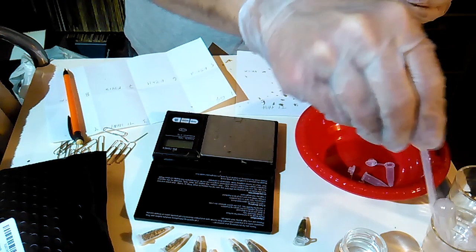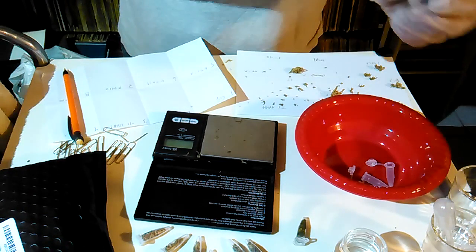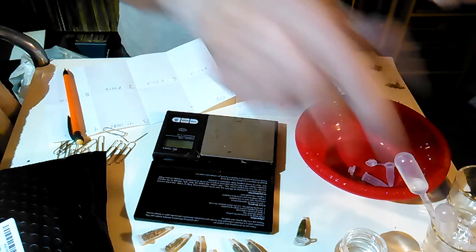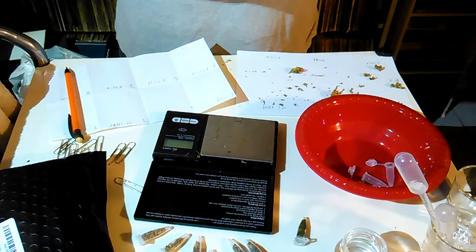And I just have these extra droppers sitting here. Eventually I'm going to use one of these droppers for the potash. But I don't know, you probably don't need 3 of them. You could probably do it with 1 or 2. So that one's easy.